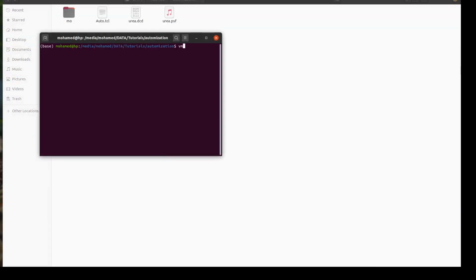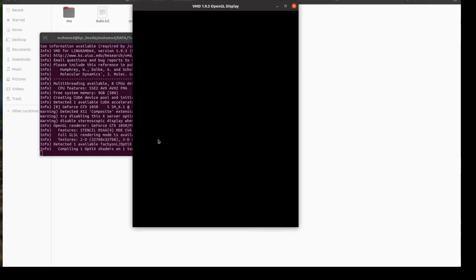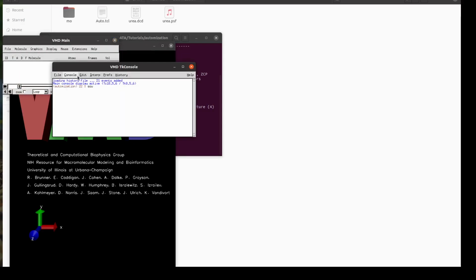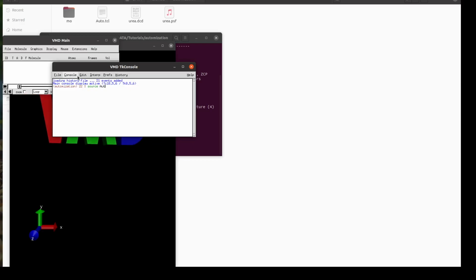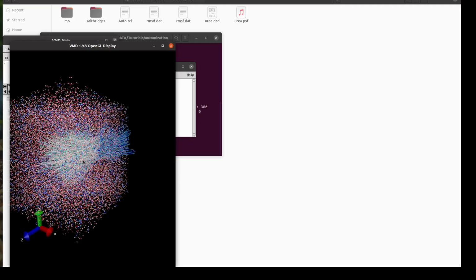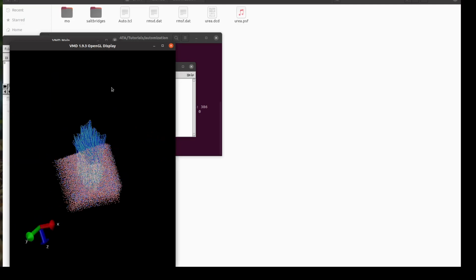to do it. I'll go to VMD, extensions, let's source our script. Yes, and I will hit enter. Now it is grabbing and aligning and doing the stuff, and it will take a while, and it is done. Don't worry, this is just some visualization issue, you know.